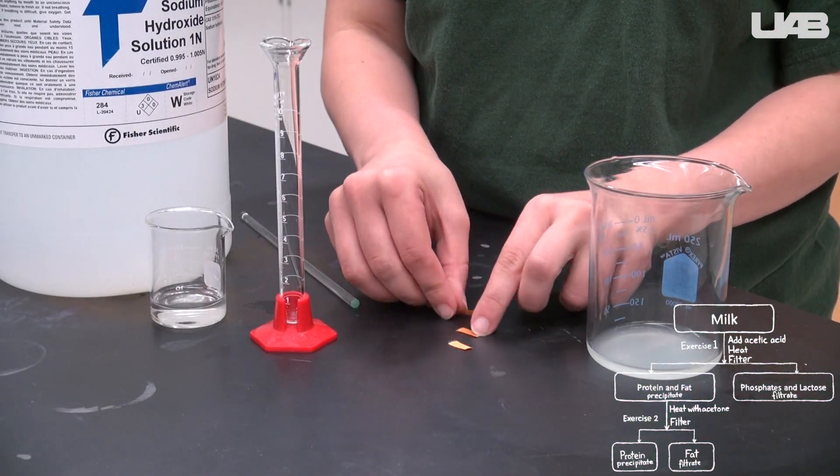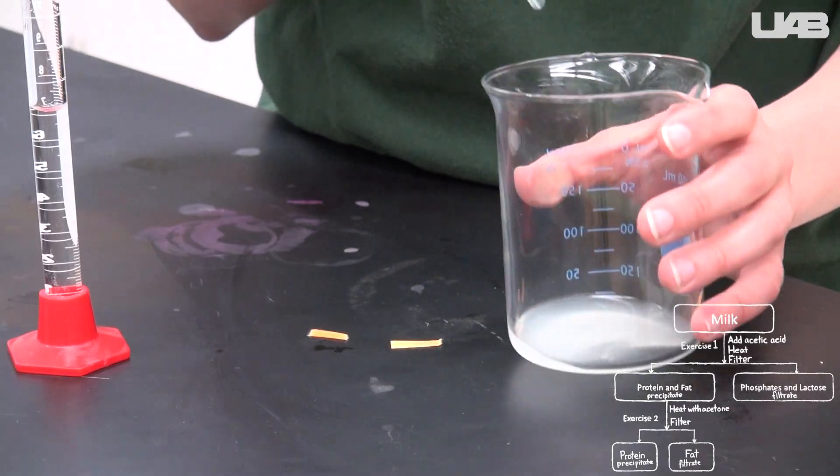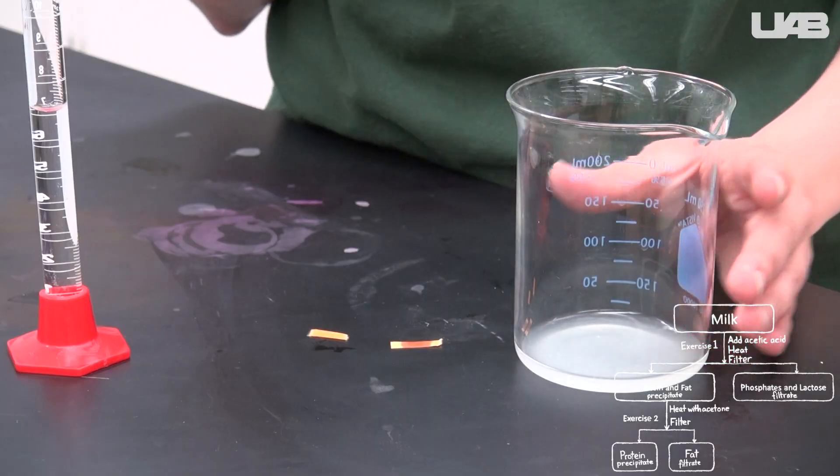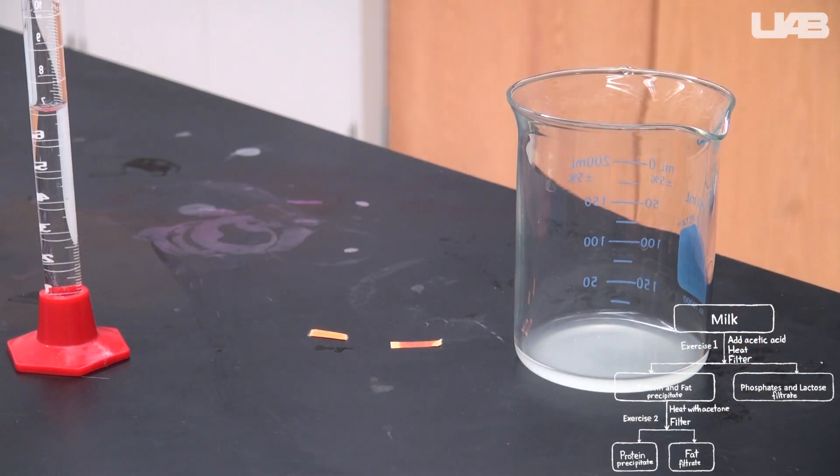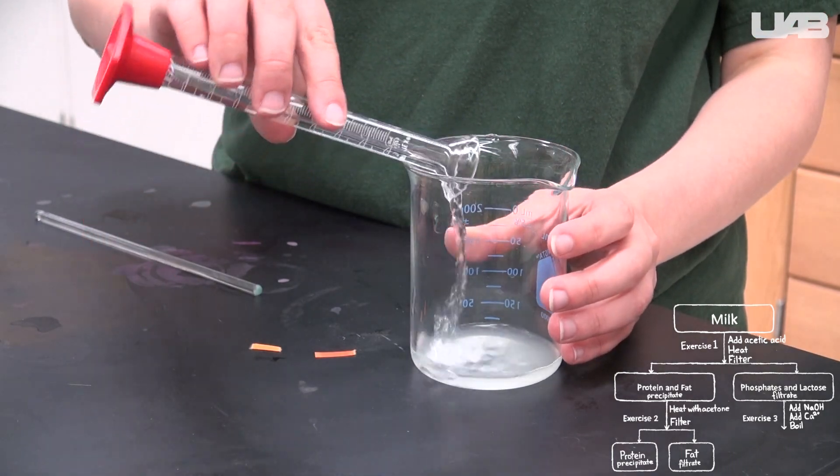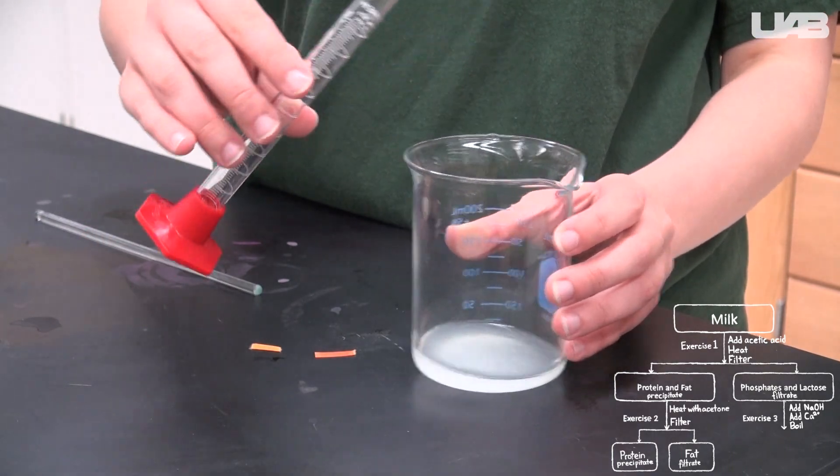Get some litmus paper and tear it into small pieces. The solution is currently acidic, which you can confirm by placing a drop of it on litmus paper. The paper will remain red. We want to turn it basic by adding a small portion, about 7 milliliters, of sodium hydroxide, a strong base.